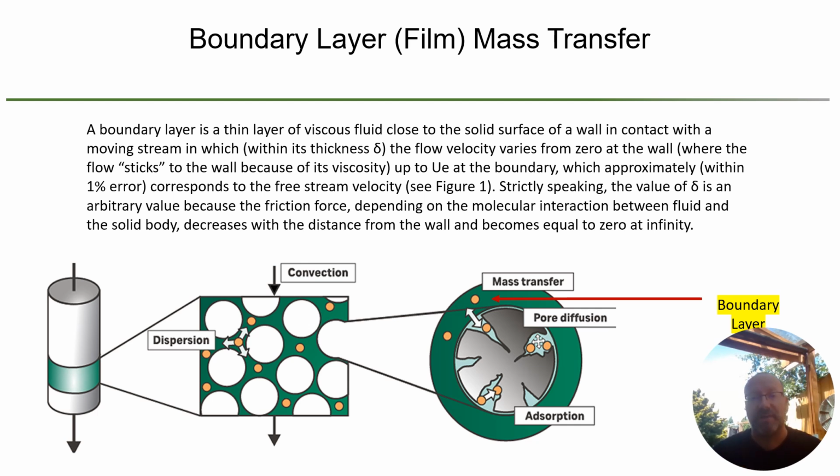Again, these are concepts that you should know doing chromatography. We are not going to have a lot of math surrounding this other than just the retention factor. But these are concepts that you should become familiar with.